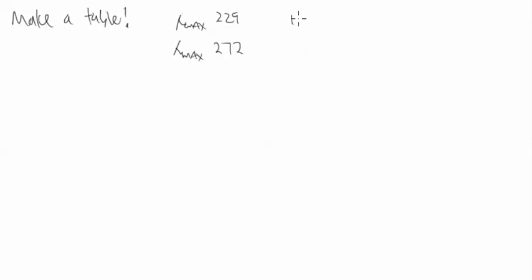And now I'm given the job of taking this mixture that has aspirin and caffeine both in it and figuring out what are the concentrations of each one of those pieces and parts. What's the concentration of aspirin? What's the concentration of caffeine? And I want to do that in one run, and UV-Vis will allow me to do it.